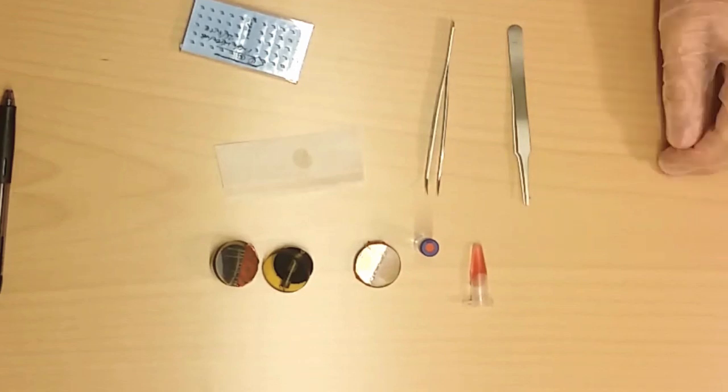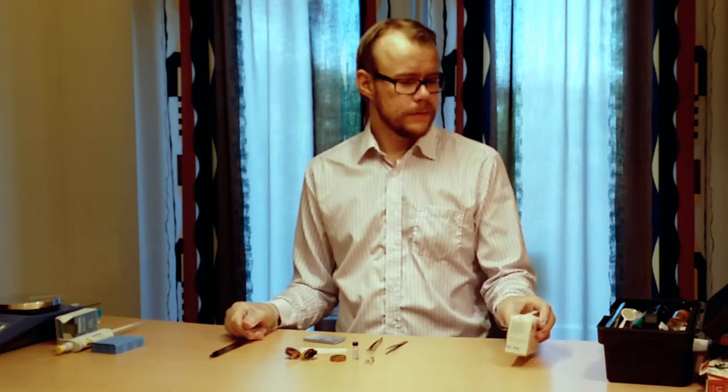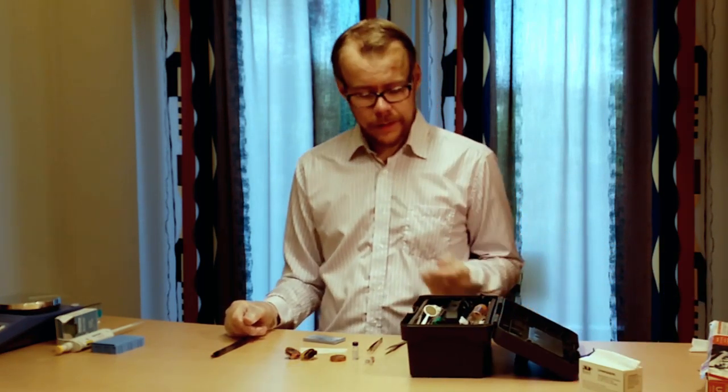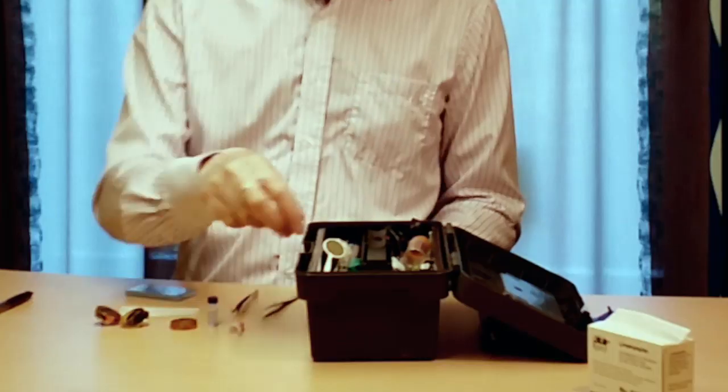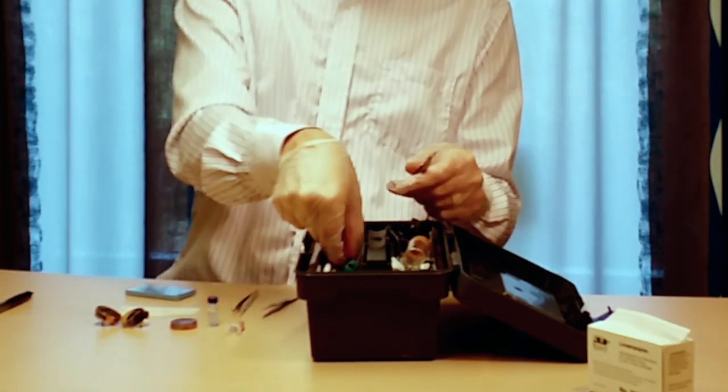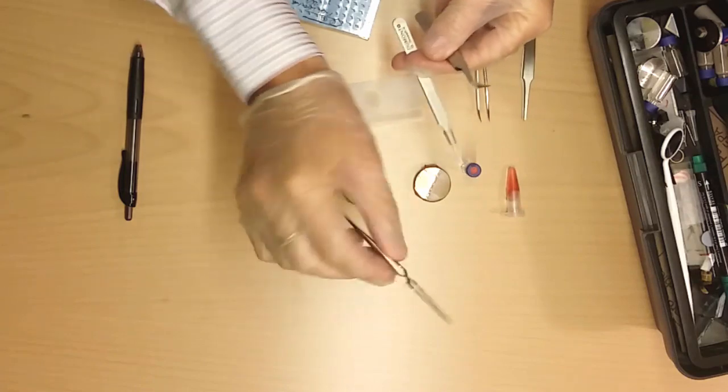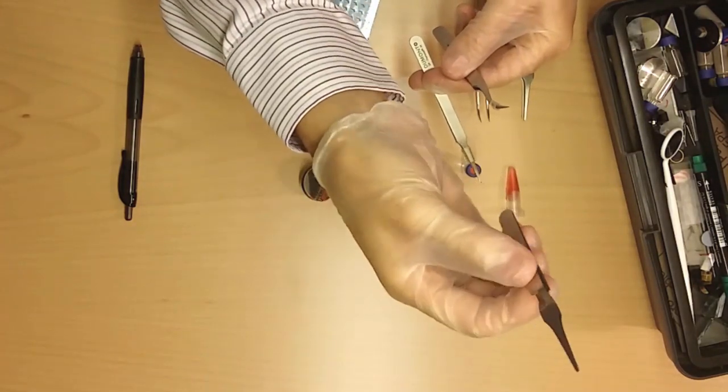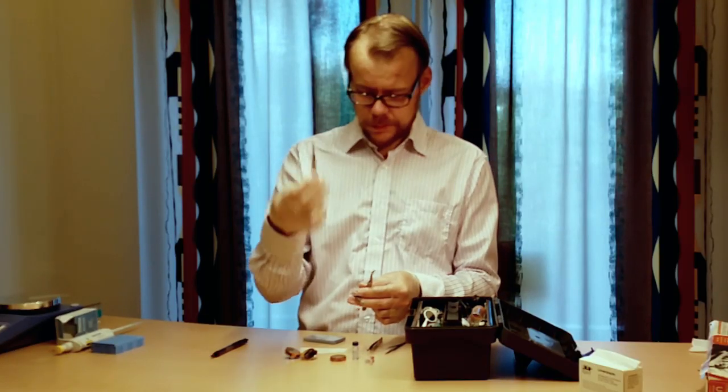As you have seen now I have been using lots of tweezers. And it is always good to have a good box with tools when you do these experiments. Here is for example my box. And in this box you can find a tremendous amount of tweezers. You can never have enough of them. This tweezers for example is a reverse one. So then you don't need to hold it firmly to grab something. You do that by itself. That is very handy.